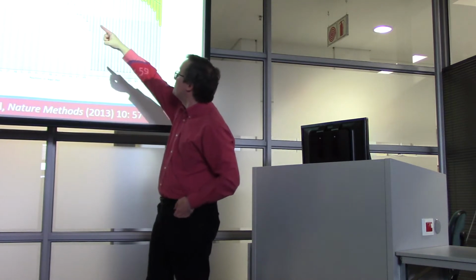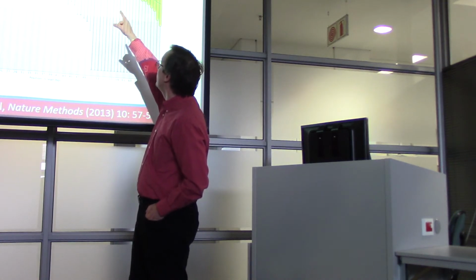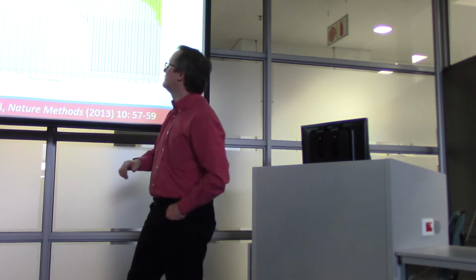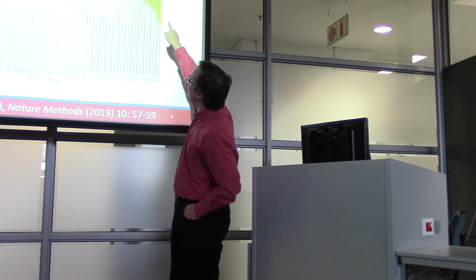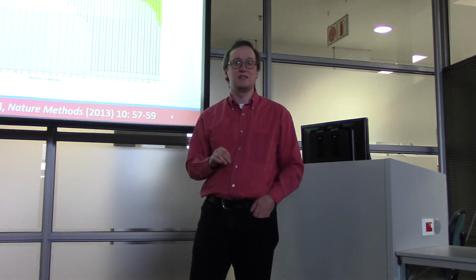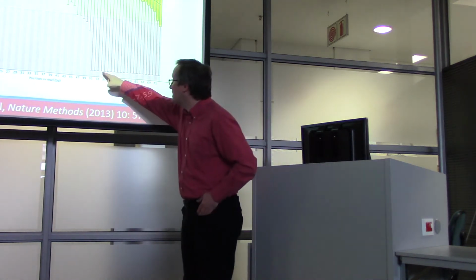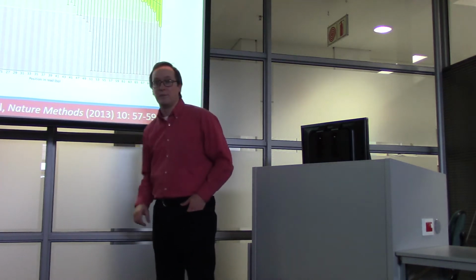So we want to keep that median quality, the red bar across the yellow, really high. Having a quality score of 40 is all very tolerable. Remember that amounts to about 1 in 10,000 missed calls. By the time we get to position 72, we see that the quality score has come down to 35, which is getting a little sketchy, right? It's not as bad as 1 in 1,000, but it's still higher than we would like. And sometimes we have some very low quality scores indeed in this space past 50.